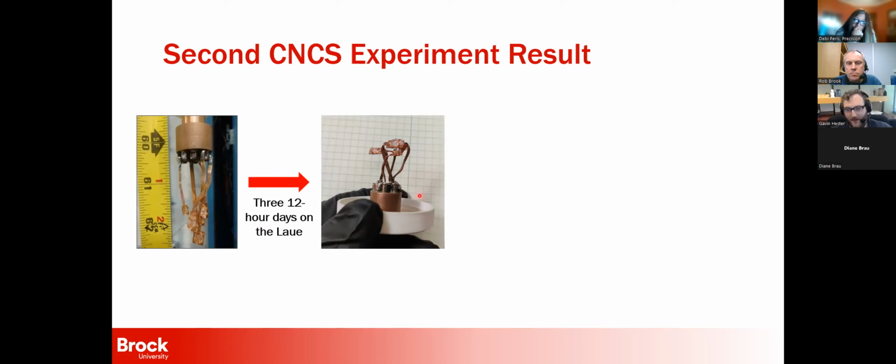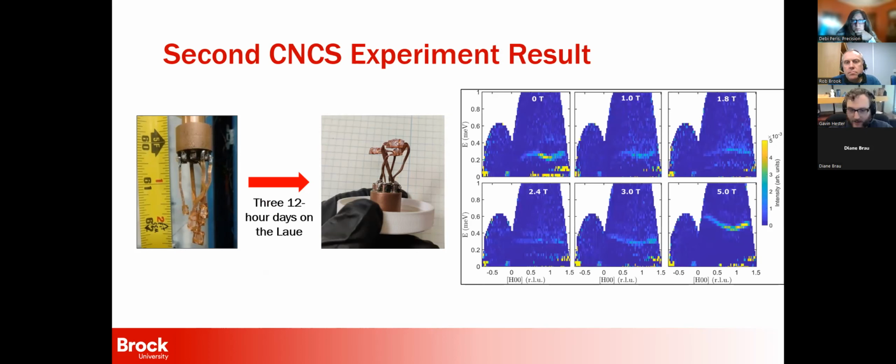You'll notice some of the copper pieces have fallen off. Obviously there were casualties in this. This was not an ideal way to do this. But this was really only possible by having a quality Laue available. And I had no concern spending the money to fly out to CSU to use their Laue, because throughout my PhD, I had used it and we never really had any issues with it. And so I ended up getting it shipped with about 3 days to spare.